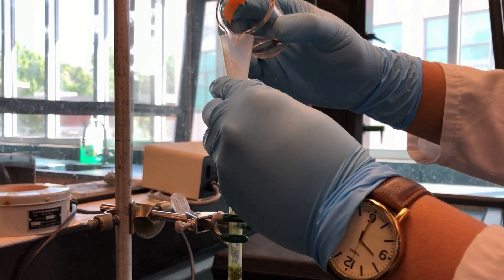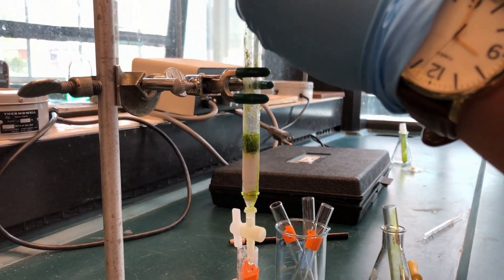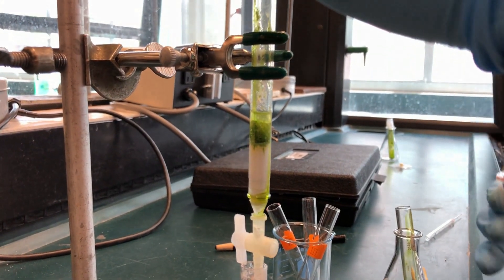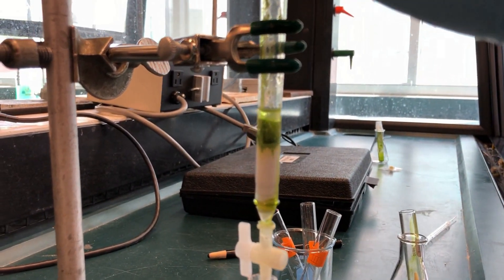If the yellow band begins to separate from the green band, continue to add petroleum ether until the yellow band gets near the bottom of the column and then collect it in test tube 2.